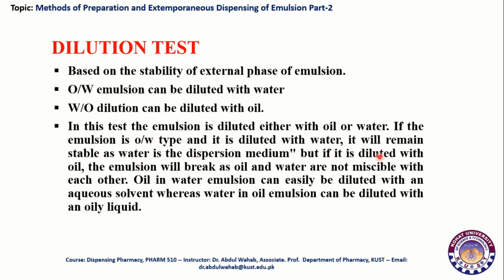But if it is diluted with oil, the emulsion will break, as oil and water are not miscible with each other. Oil in water emulsion can easily be diluted with an aqueous solvent, whereas water in oil emulsion can be diluted with an oily liquid.